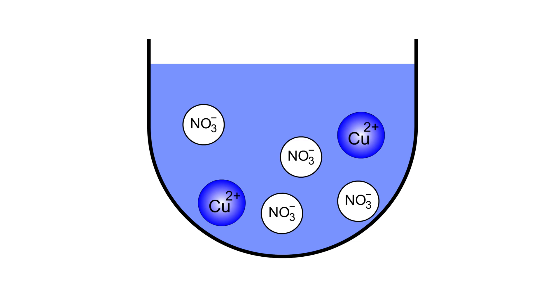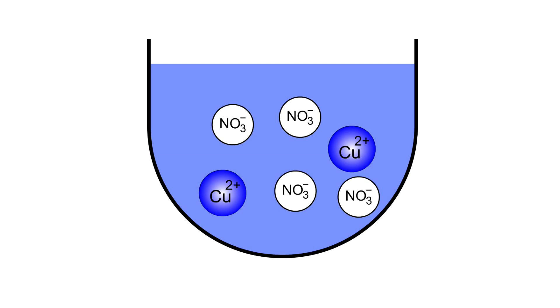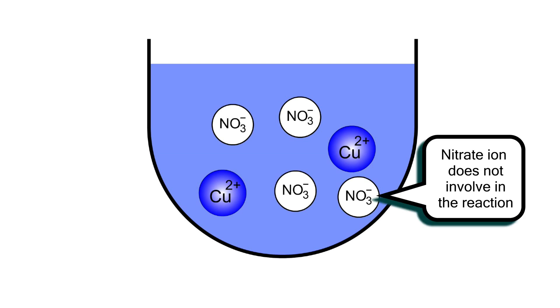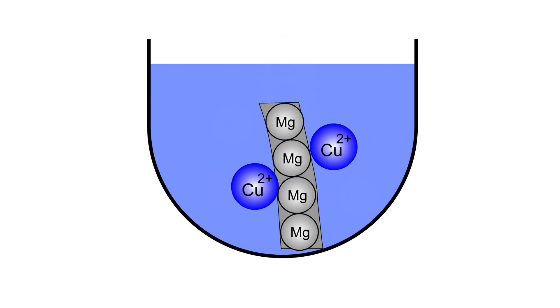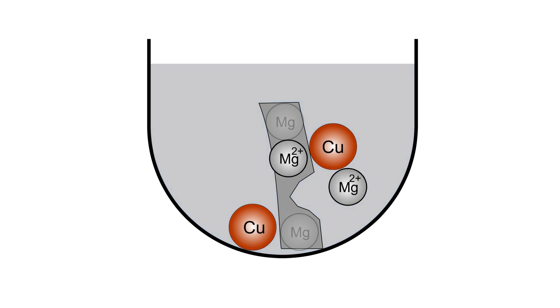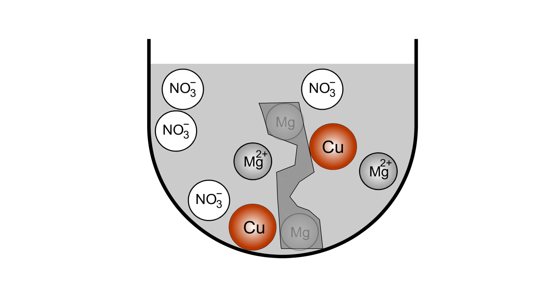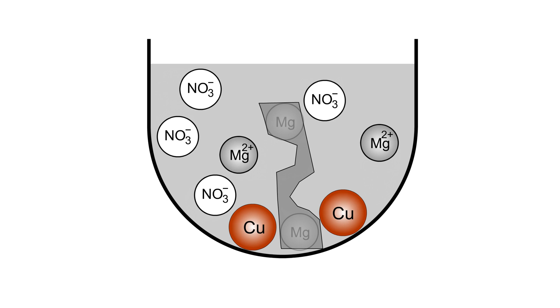The blue copper two nitrate solution contains copper two ions and nitrate ions. Nitrate ions are spectator ions that are not involved in the reaction and are ignored. Magnesium donates two electrons to copper two ions, producing magnesium ions and copper metal. Copper metal can be seen as a brown deposit in the test tube. The blue color of the solution becomes less intense. Magnesium dissolves into the solution and becomes thinner, and magnesium nitrate solution is produced.